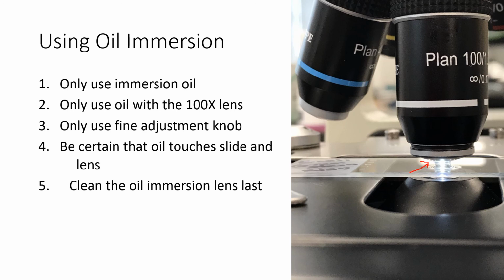So those are some tips and hints. The best way to learn about microscopy for microbiology is to actually do it. So I look forward to seeing you in the lab and practicing and learning this important skill.